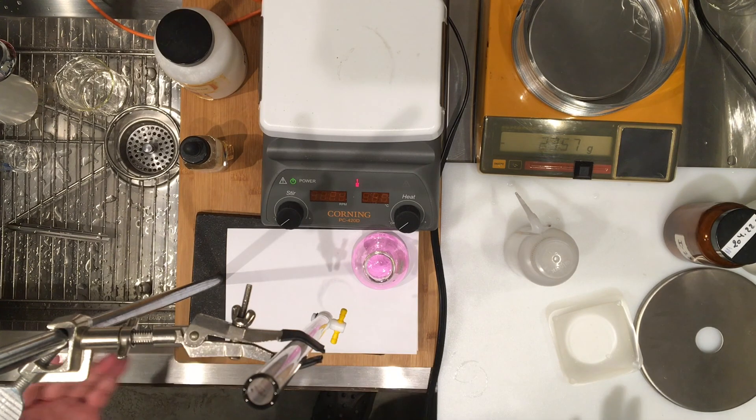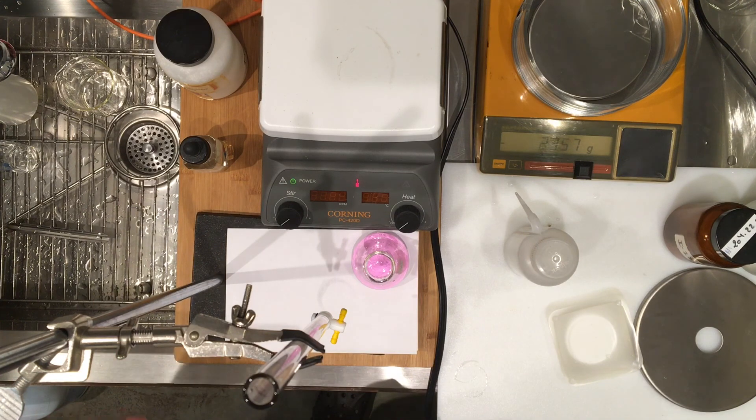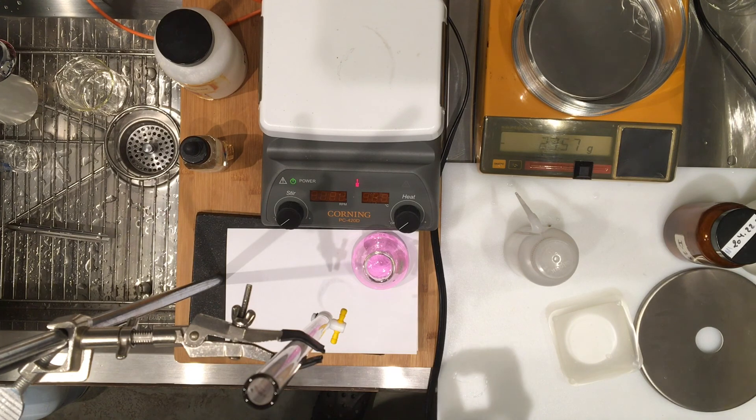The titrations are exactly done the same way, but you also need the masses of each KHP sample. So I'll provide you with the mass of each KHP and I'll provide you with the volume of the titrant sodium hydroxide, and that's all you need to calculate the molarity of sodium hydroxide.